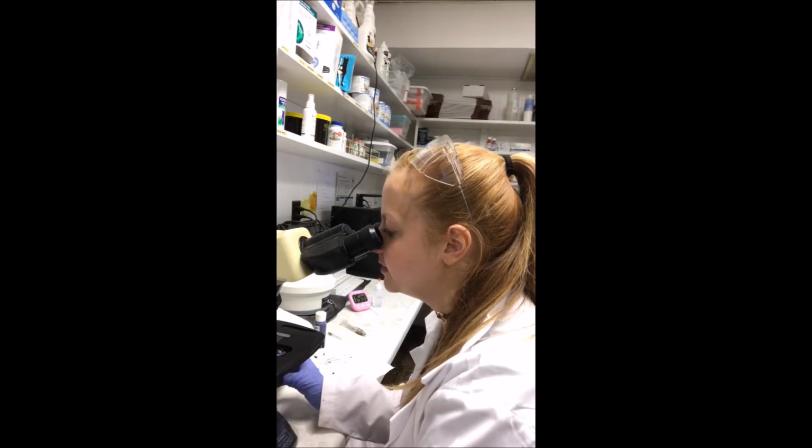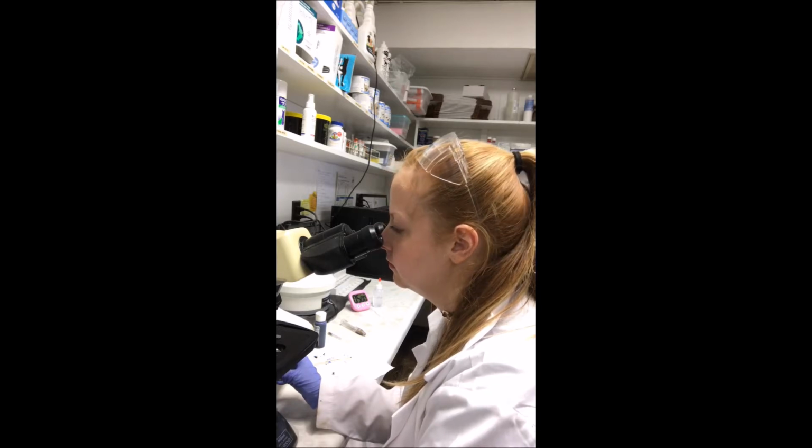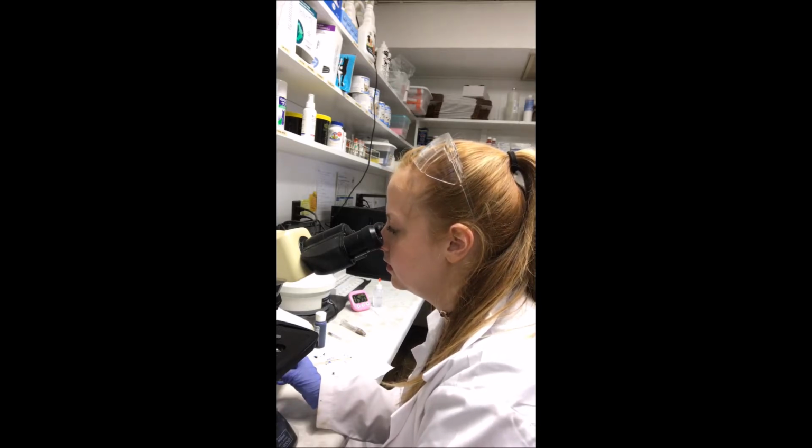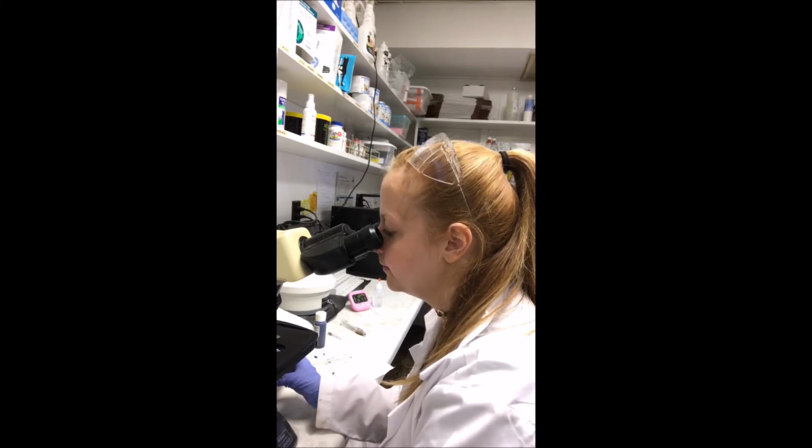I'm not seeing any microfilariae, so she's looking to be negative. There's another Dipetalonema. I'm probably not pronouncing that correctly. Okay, no microfilariae though, so let's just come over here for a minute.